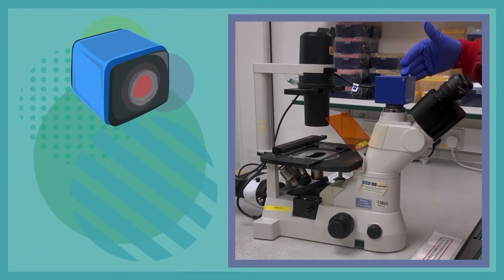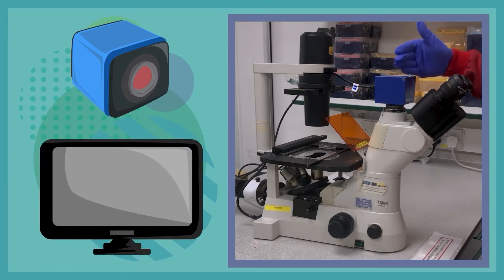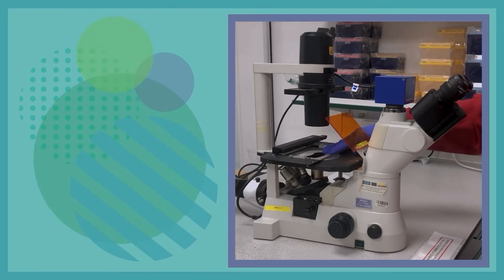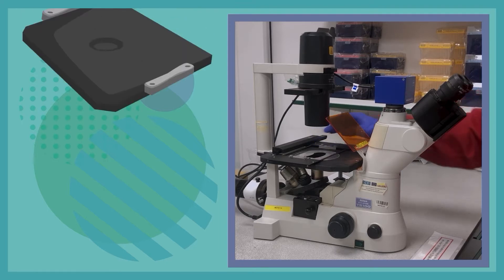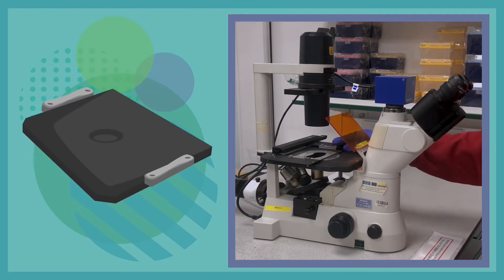Next we have the camera which is attached to an accompanying computer so we can view ourselves. We also have the microscope stage which is where you place the samples and you can clip them into place using these metal clips.